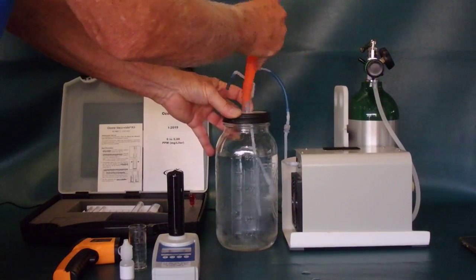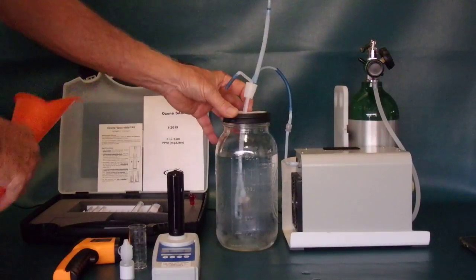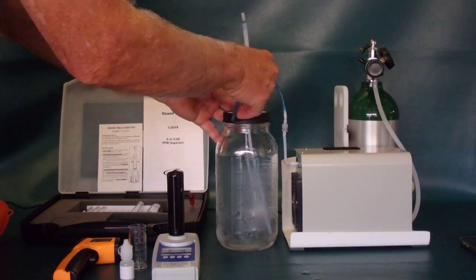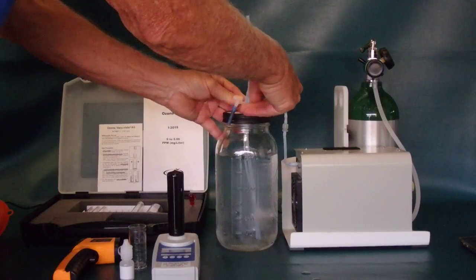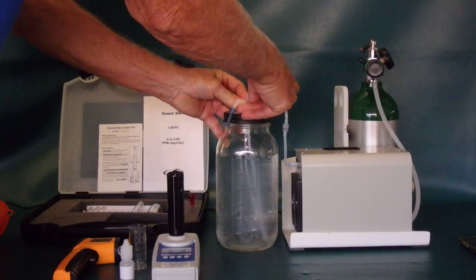Now this is chilled water and chilled water is very important to get maximum concentrations. At room temperature, that is 70 degrees, you really can't exceed 3 parts per million ozone. That's just the maximum due to the temperature effect of dissolving ozone in the system.